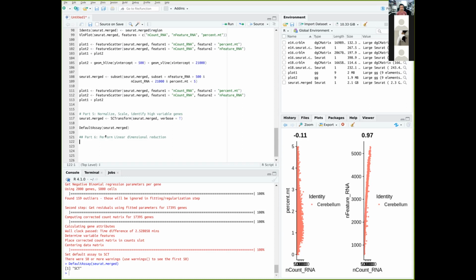So the idea behind dimensional reduction is to compress this vast information so that it will now be referenced based on at least a two-dimensional axis. So you can plot it on an x-axis and a y-axis, and you can also compare these coordinates between two cells to see which cells are closely related to each other. All right. So in summary, a very big matrix compressed into just x and y values.